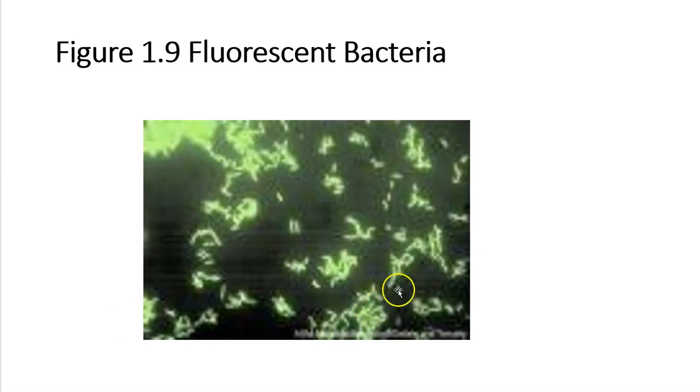When you get there, I can definitely see this is separate from this, this, and this. As we go up in magnification, that ability to differentiate, that ability to resolve that these are two separate bacteria becomes important. Okay, does that make sense?